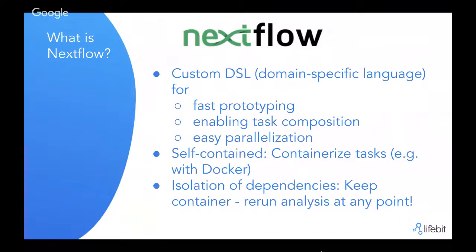Yeah, and then as we mentioned, it's containerized. This is really useful for all of your dependencies. You can use both Docker and Singularity, and it helps you rerun your analysis at any point. So it's a lot more reproducible, which is a really big problem in bioinformatics in general.